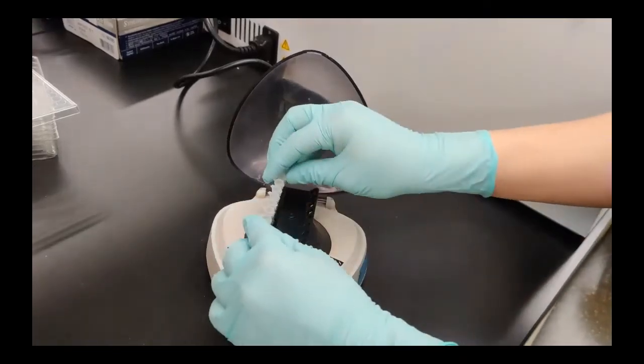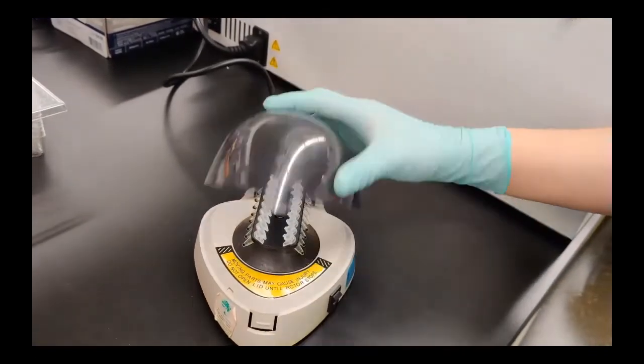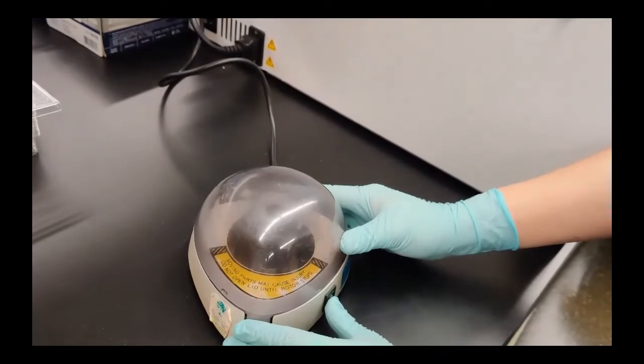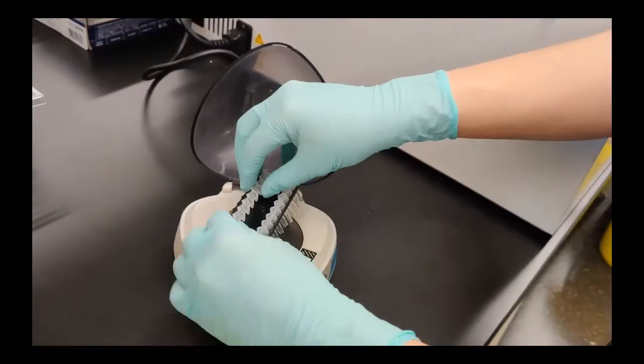To make sure all the samples and all the liquids are at the bottom of the tubes, we will use a centrifuge, a smaller one than the one we used earlier, to make sure all the liquids are at the bottom.